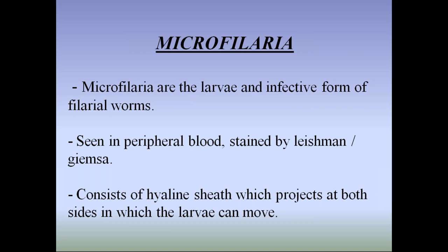We can't see it in unstained films. We can't see these larval forms in a wet mount. We have to stain the peripheral smear with Giemsa or Leishman stain, or any Romanowsky stain, and then we can identify the microfilaria larva.